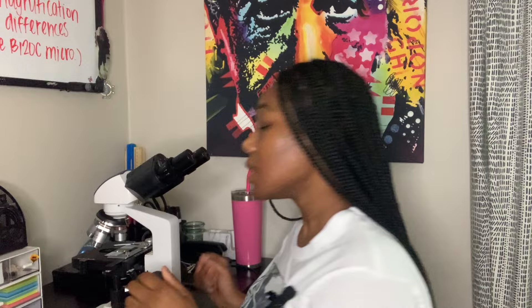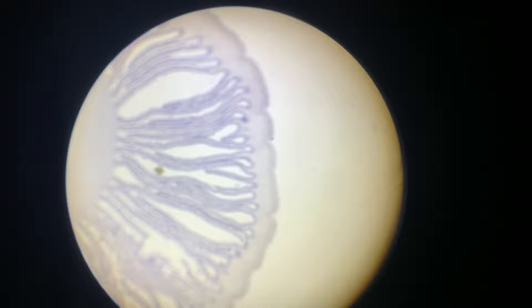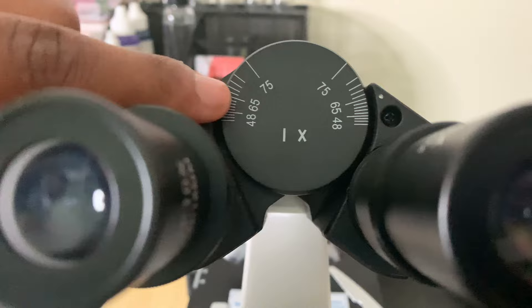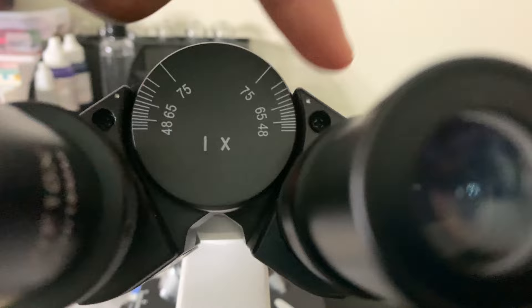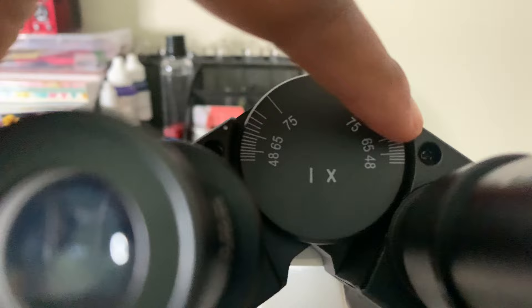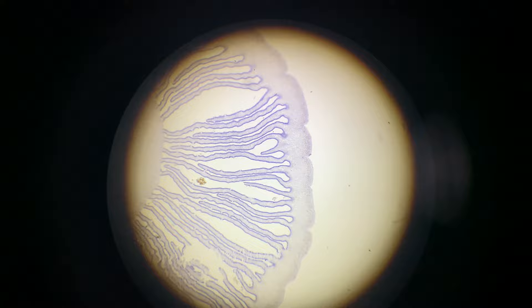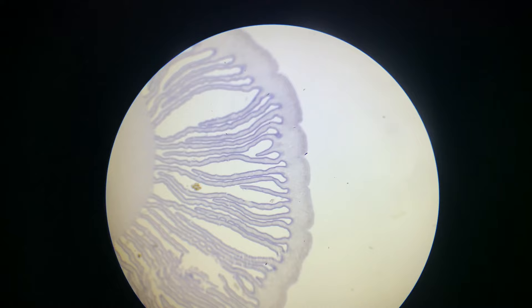Now I'm gonna let y'all see. I have mine set at 65 — you can see the indicator showing it lines up at 65. When I look in on the left side it looks just as clear, if not better. So yeah, they look the same, or at least they should. When you look with both eyes, both should look clear.